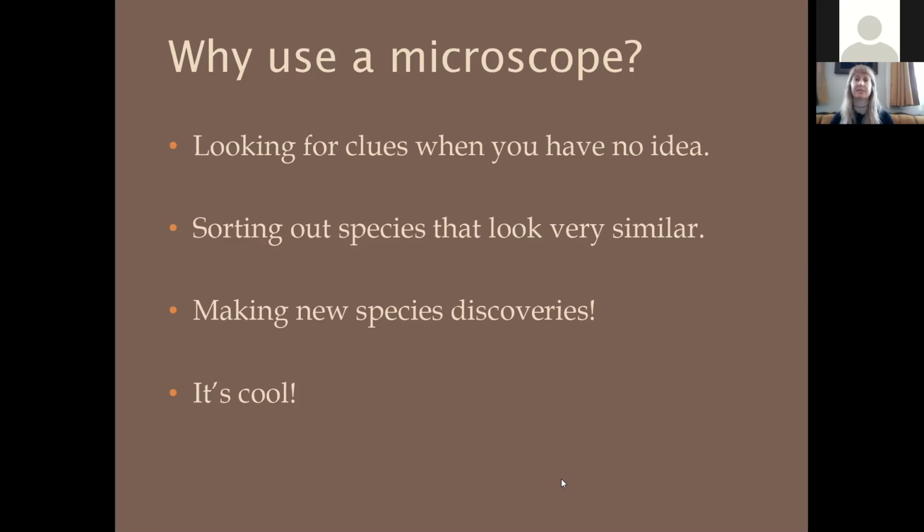And one of the things that are different with them will be the microscopic features. So if you happen to find something and you get the DNA done on it, turns out it's completely something new, you're going to need to make all of these notes about what the microscopic features are, as many of them as possible, so that somebody doesn't have to run the DNA the next time to know that this is compared to what you found.